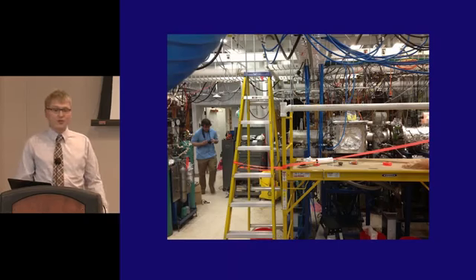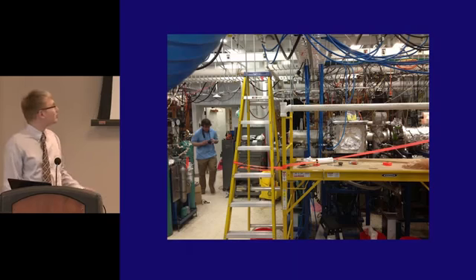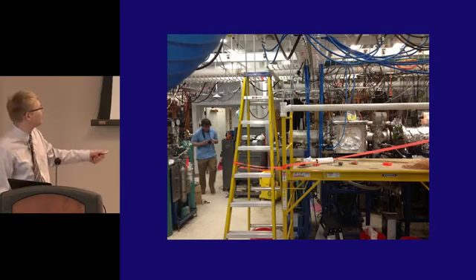And here's a before picture. So as you can see here, the photoelectron spectrometer, at least the front half of it, is already existing. We can see it right here in this picture with these stainless steel chambers. However, what's eventually going to become the electrospray is currently taken up by this set of scaffolds, ladders, and caution tape.